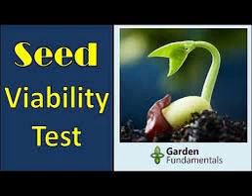Upon hydration, the activity of dehydrogenase enzyme increases, resulting in release of hydrogen ions, H+, which reduce the light yellow or cream colored compound tetrazolium salt solution, 2,3,5 triphenyl tetrazolium chloride, into a red colored compound called formazan. Hence, it is used to differentiate between metabolically active and inactive tissues. Formazan stains living cells red while dead cells remain colorless. The viability of seed is interpreted according to the staining pattern of seed.